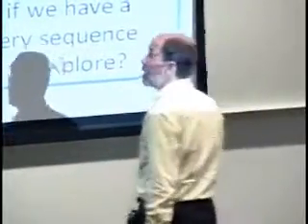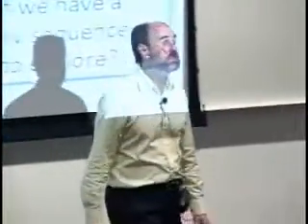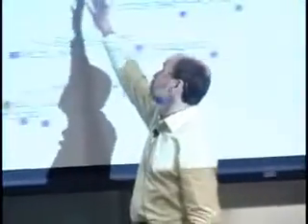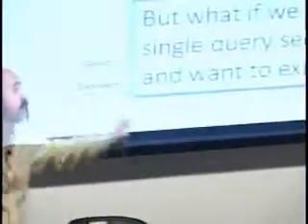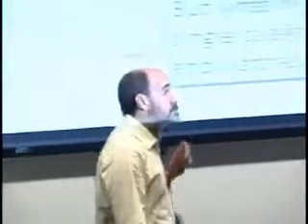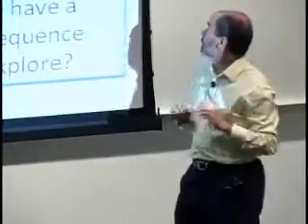Okay, and so what you've actually got is an e-value which is exponentiated and squashed so that we get some sort of correspondence between the e-value and the radial distance on this display. So what we see obviously are the ones close to the query node. They're the ones which are very good matches. Further out from that we start to do badly, and when we come right out here there's very little correspondence at all. The other point about this is that the map shown is based on pre-computed blasts, okay? N versus N minus 1 blasts for multiple E. coli genomes. So there are about 70,000 genes in this collection based on 14 strains of E.